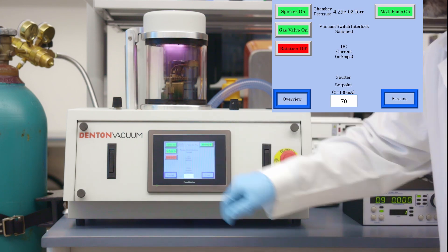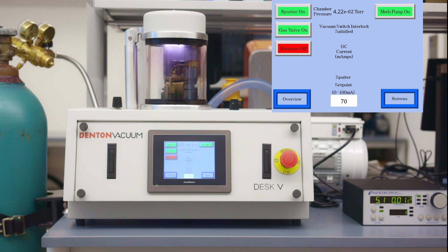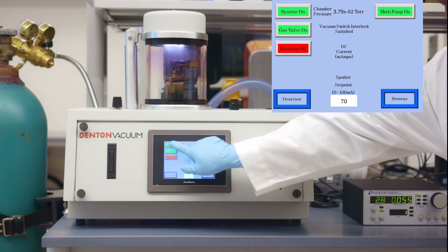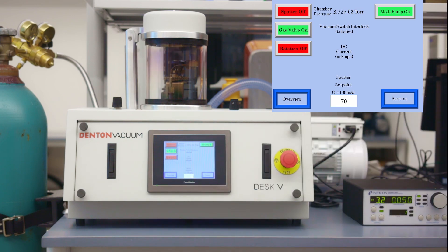Now tap on sputter off. We will see a purple glow in the glass jar indicating the sputter process has begun. Once the thickness monitor reads 0.05 kilo angstrom, we can stop the sputtering process by tapping on sputter on.